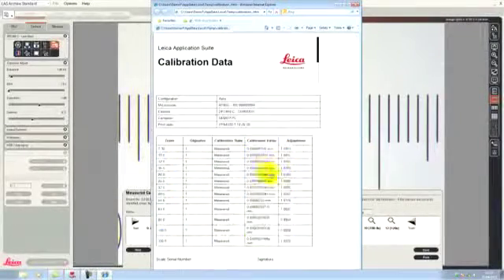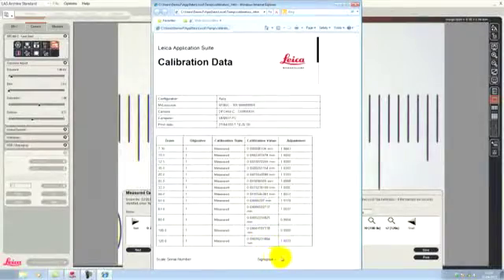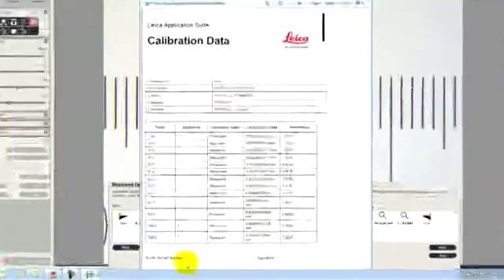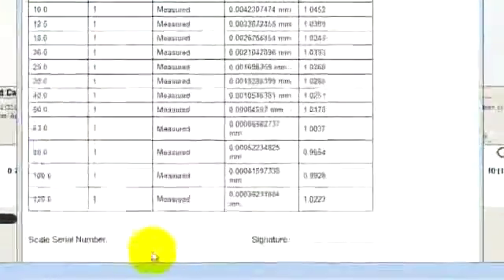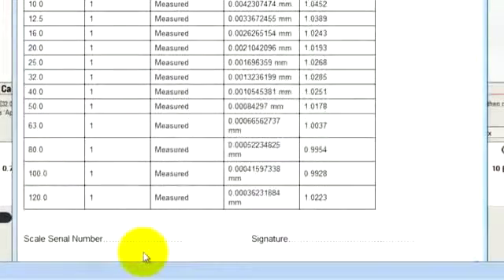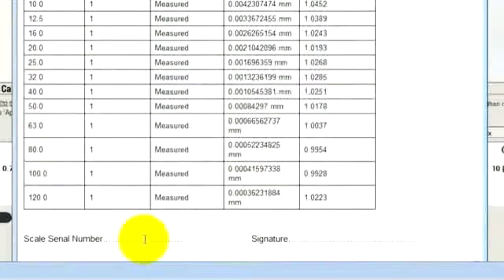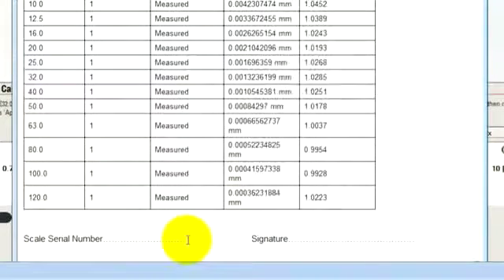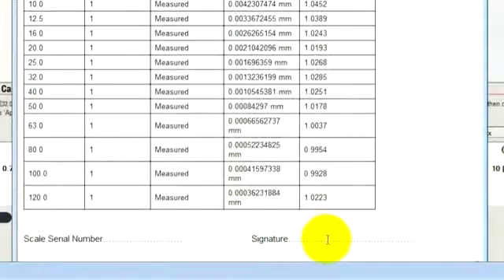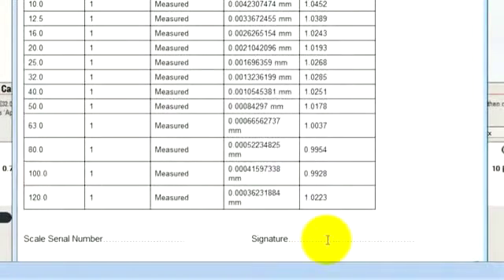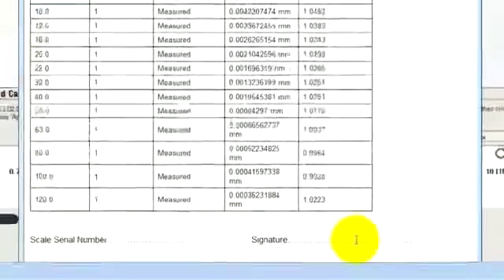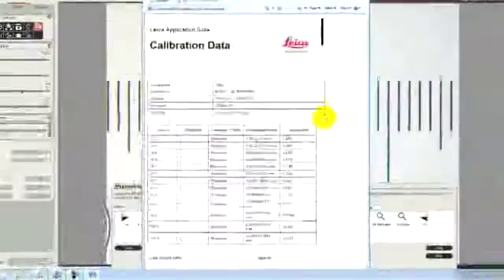If I'm happy with this, I can now print out this form and write on the form the serial number of the calibration graticule that was used, so that we can confirm its traceability. And the operator that had performed the calibration can sign it to say that it was done according to the standards.